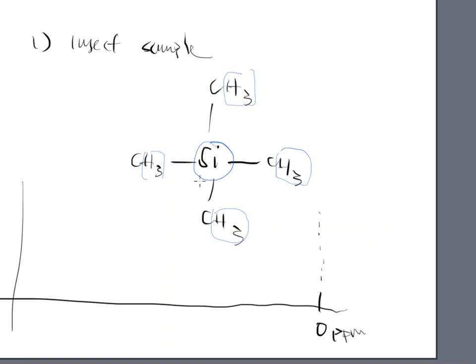It's a silicon atom, right? Si. So this Si is actually less electronegative than carbon. And what this means is that we are guaranteeing that this is the furthest to the right on the NMR spectra. This really is the 0, because what you're going to find out is that on the NMR spectra, 0 does not start to the left like a normal calibration curve would. 0 starts all the way over to the right-hand side, and it works backward from there.